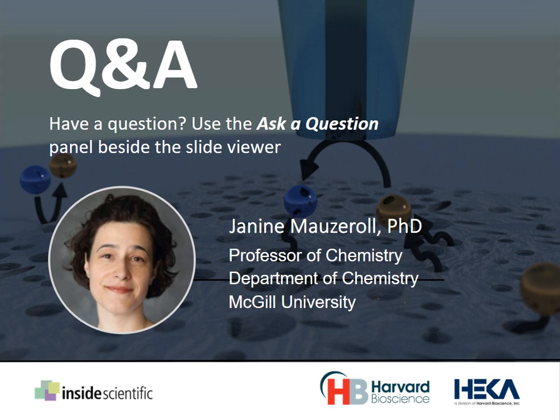And so it's important to choose your redox indicators correctly because in substrate generation tip collection mode, you'll still want to approach the surface pretty close before you carry out the measurement. You could do this and also change the solution if you want as well. That takes more time. So there's lots of strategies by which you can do this. It takes a little bit of experimental design at the beginning, asking yourself, what's the standard potential of the mediators? Will there be interference? So you do have to know a little bit about your substrate before you start imaging it.